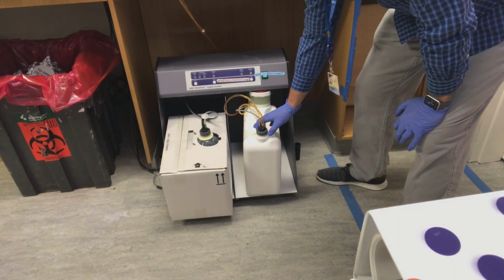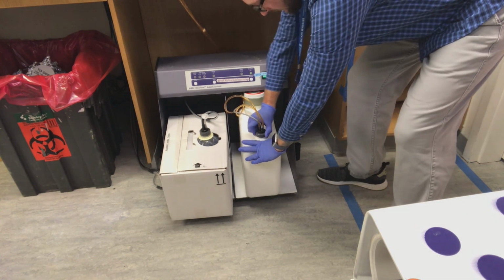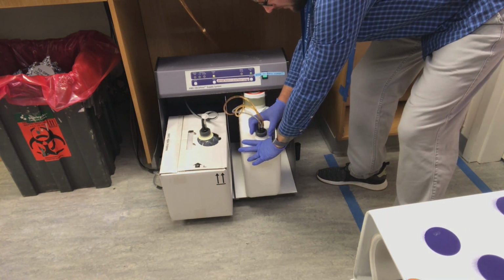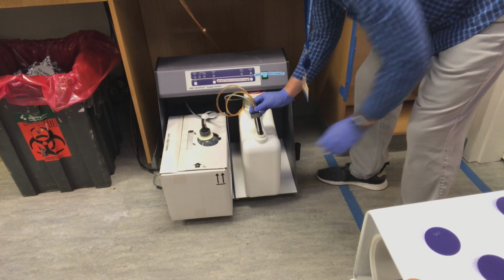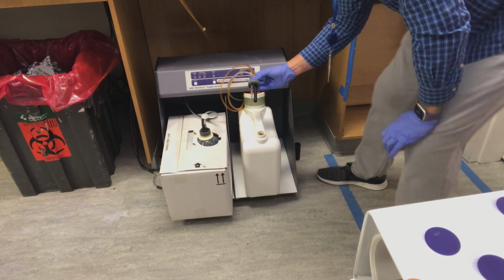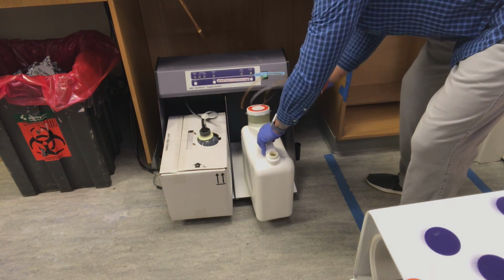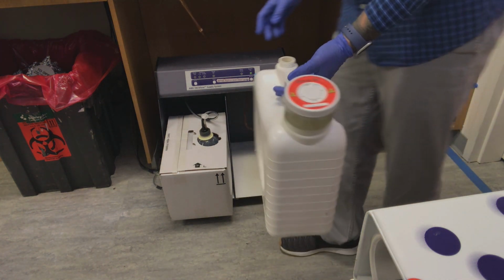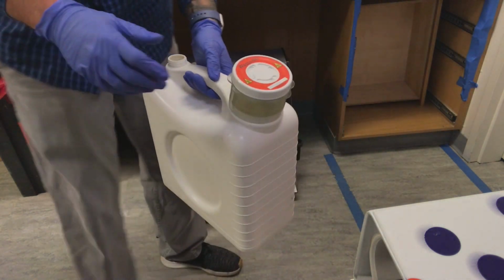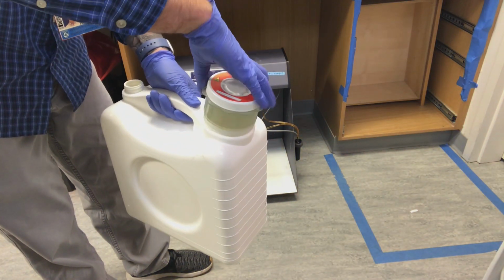If your waste tank needs to be replaced, you can loosen the probes here and put them in the little side holster out of the way. Take your waste tank and unscrew the filter.